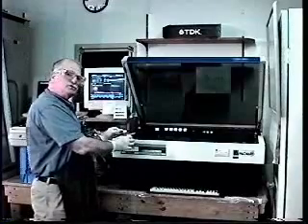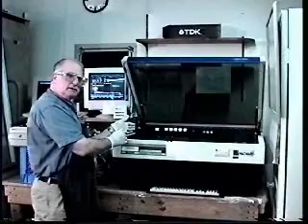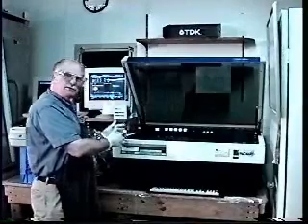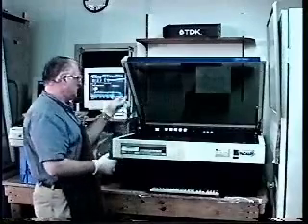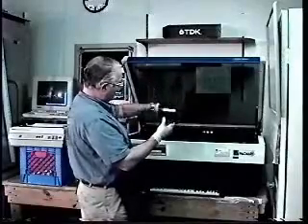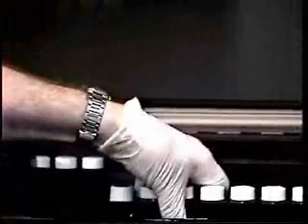If only one tube sees it, then that could be static from other electronics in the machine, or it could be from cosmic radiation that is not relevant to what we're looking for. So we'll put this in the cassette. This cassette automatically travels around, and then when the time comes, it'll go down into the elevator and go between the two tubes.